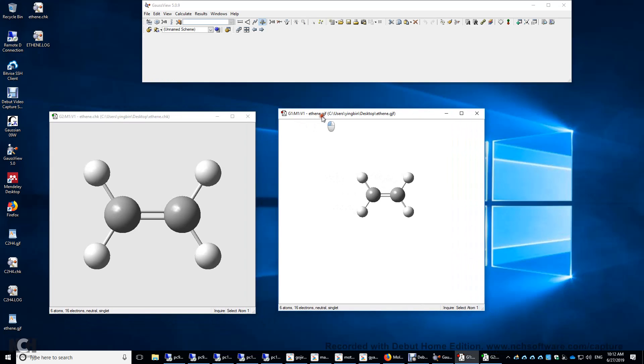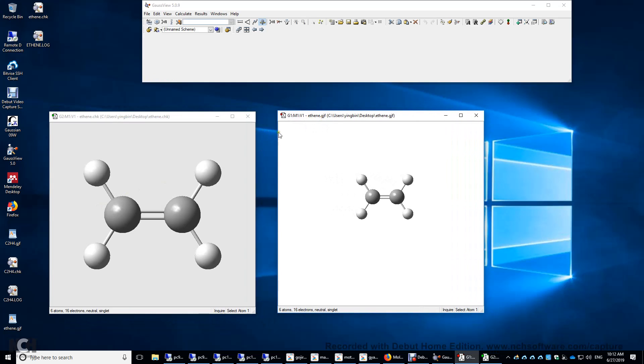Now you have the optimized structure here. This is the input. This is output. And let's look at the bond distance here.